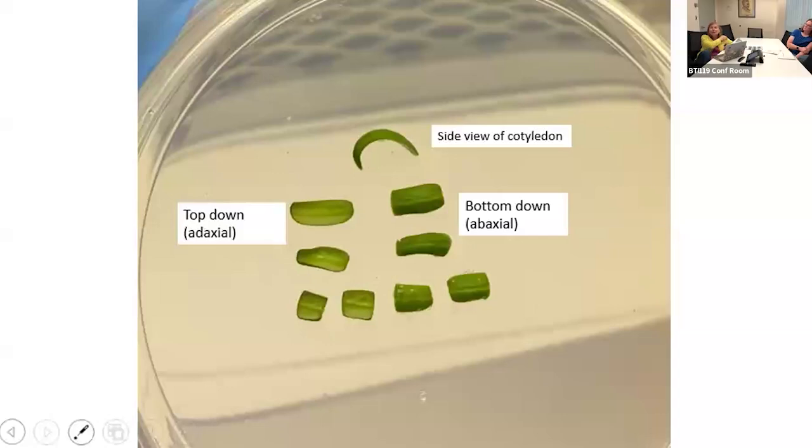I guess it could depend on the species. We use AGL1 for our tomato, and we don't have a problem with overgrowth. But if you use it for maize, you do. It's a plant pathogen, right? So it's going to be acting differently, and we can't say across the board if it's better or worse.